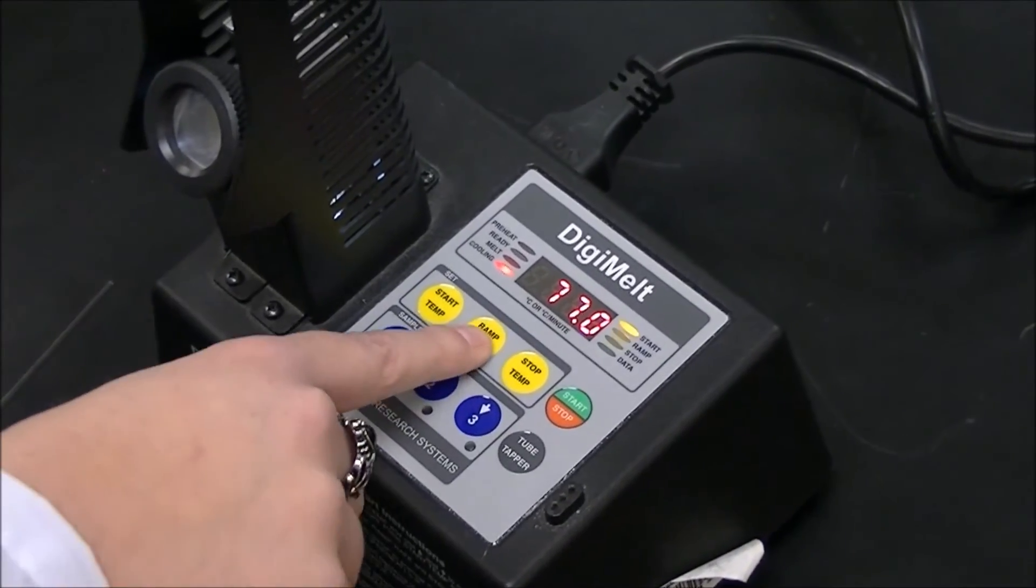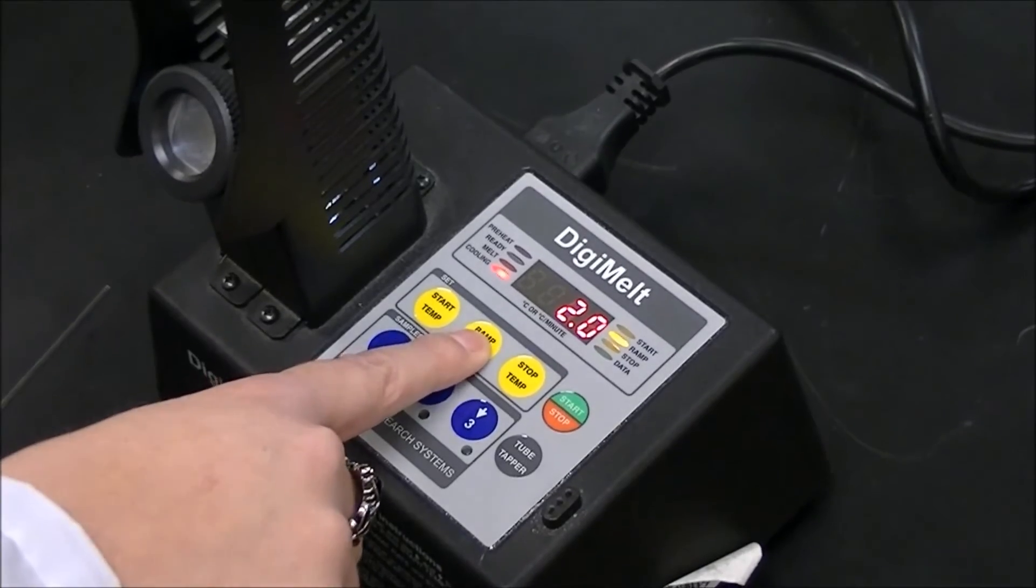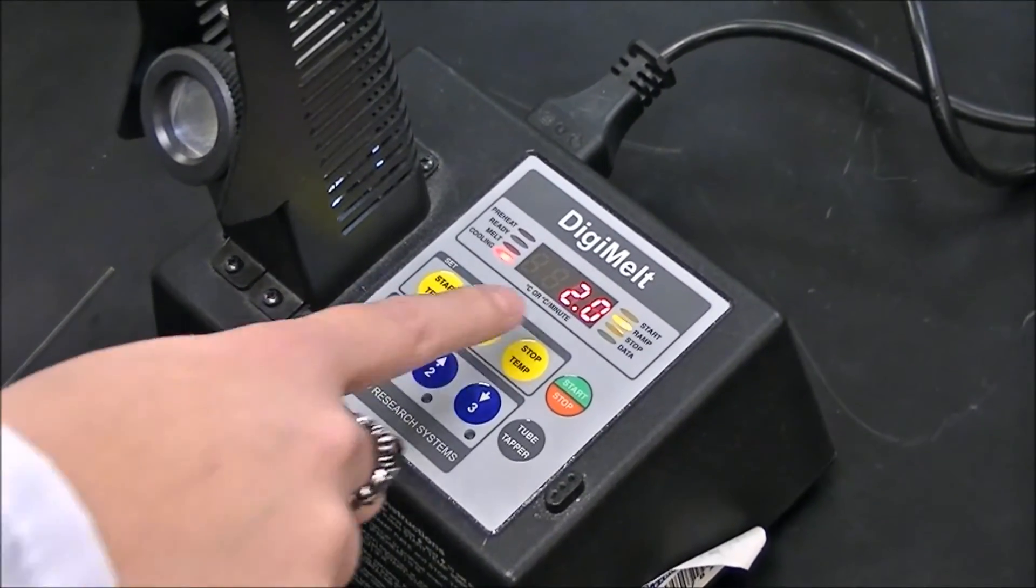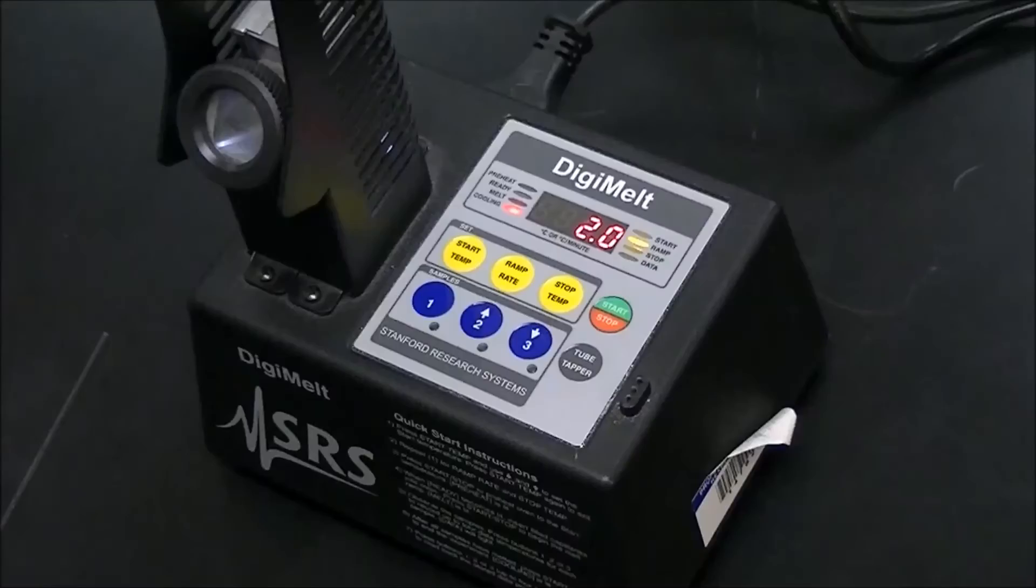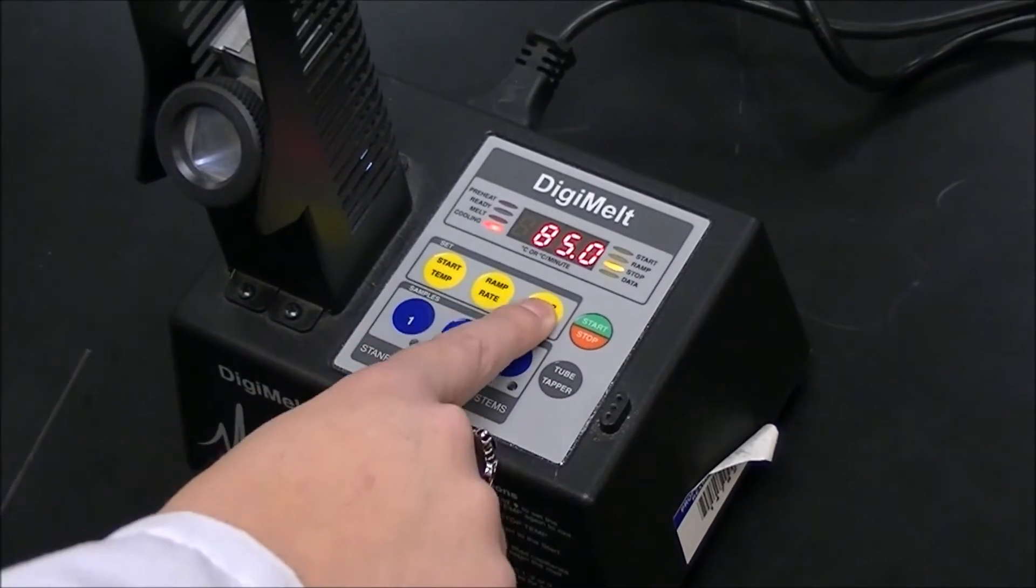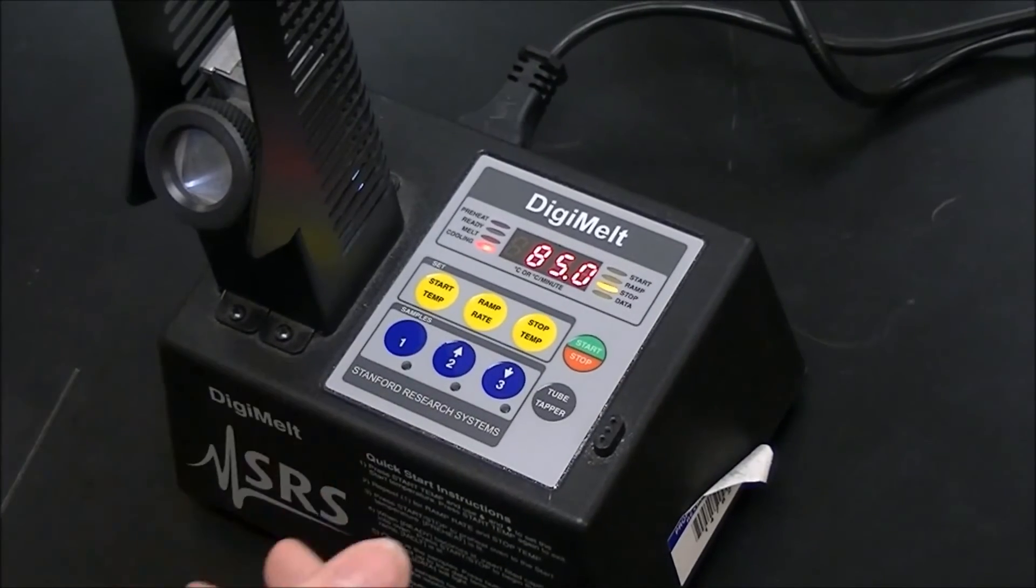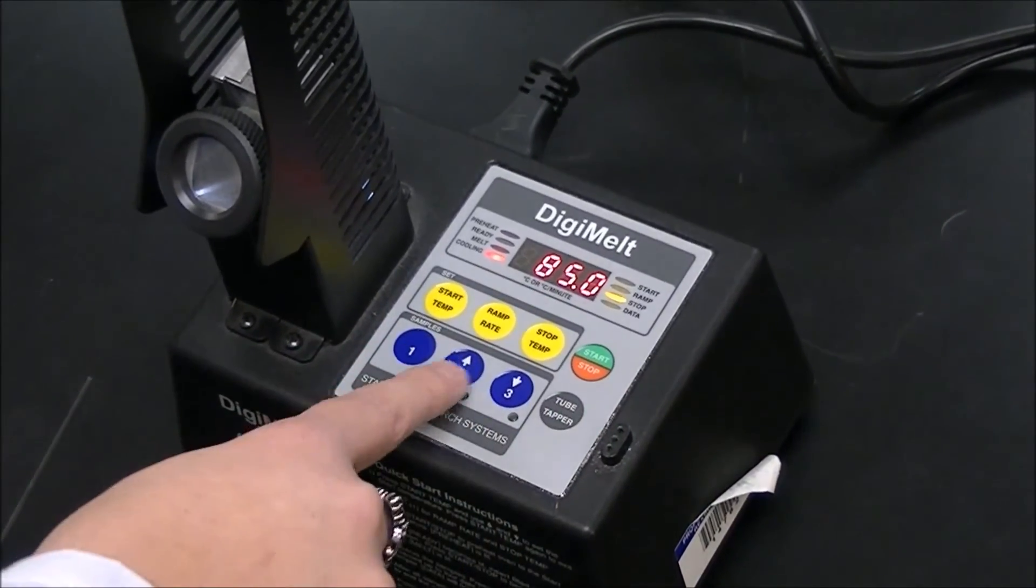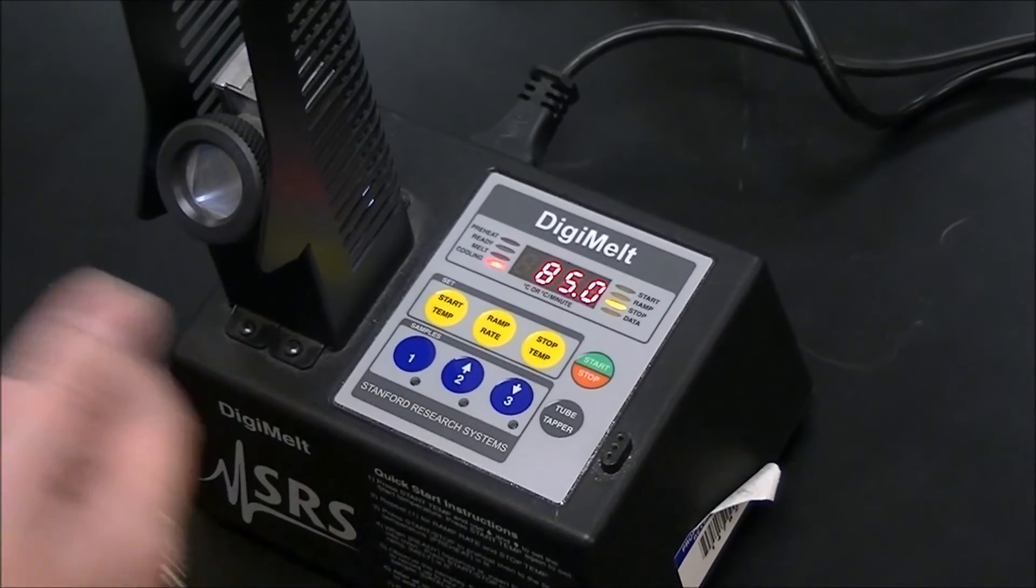Next you're going to push ramp rate, and this is how many degrees per minute the temperature is going to increase. So typically 2 is good. Next you're going to press the stop temp, and this is the temperature that is slightly higher than the 83 degrees. So we have ours set to 85, but you can use the up arrow or down arrow to adjust as needed.